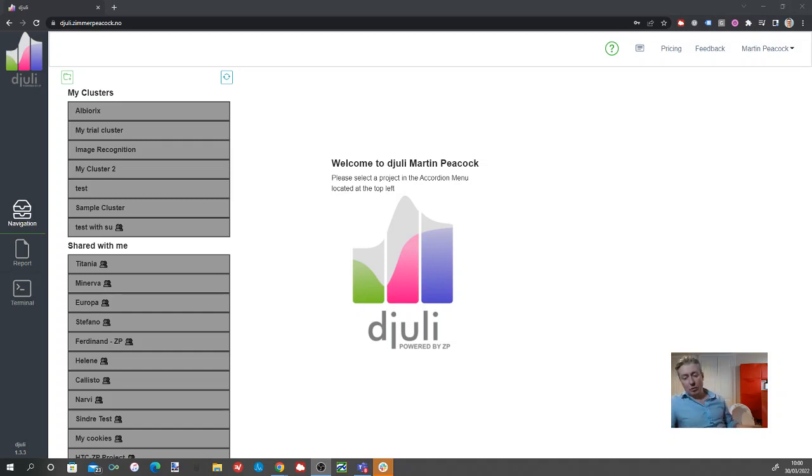So at Zimmer and Peacock, we have lots of collaborations with academics, or with academia rather. We also have collaboration with industrial partners. We provide technical support. So in many ways, we need to see essentially people's electrochemical data, because it's either a formal collaboration or it's a technical support.